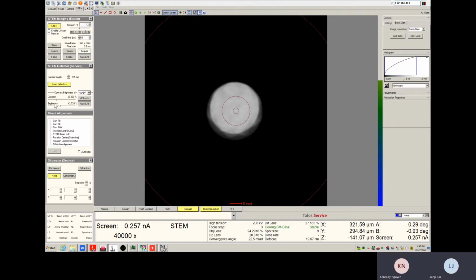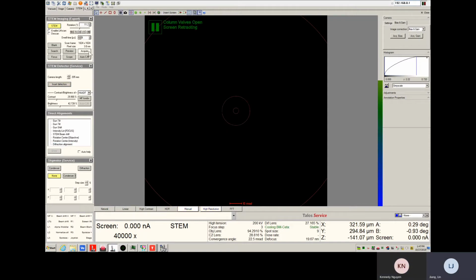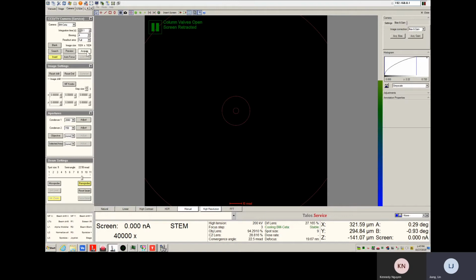Okay, then you take the detector out. Leave the screen. Oh, sorry about that. So go here.